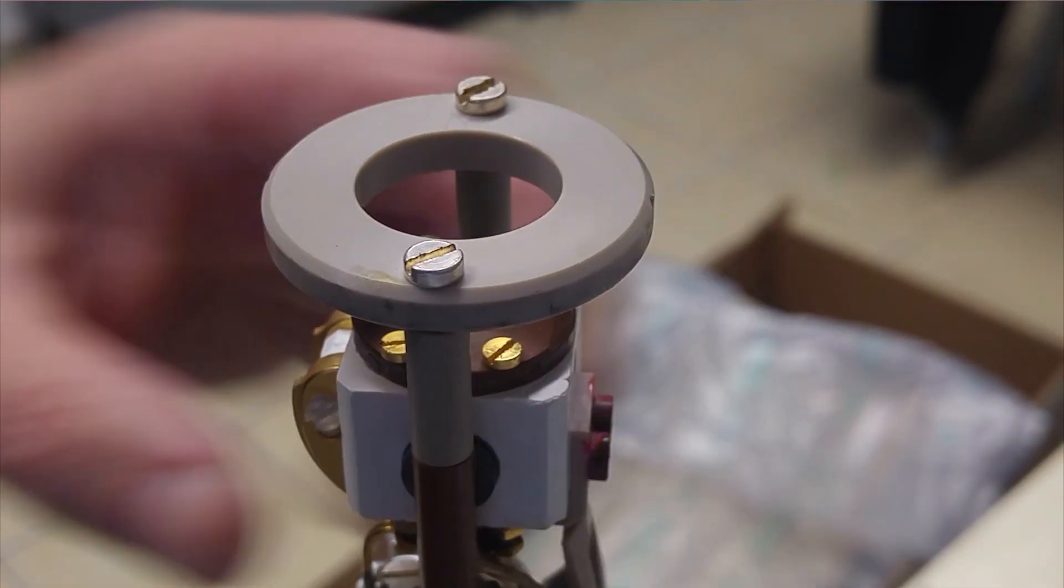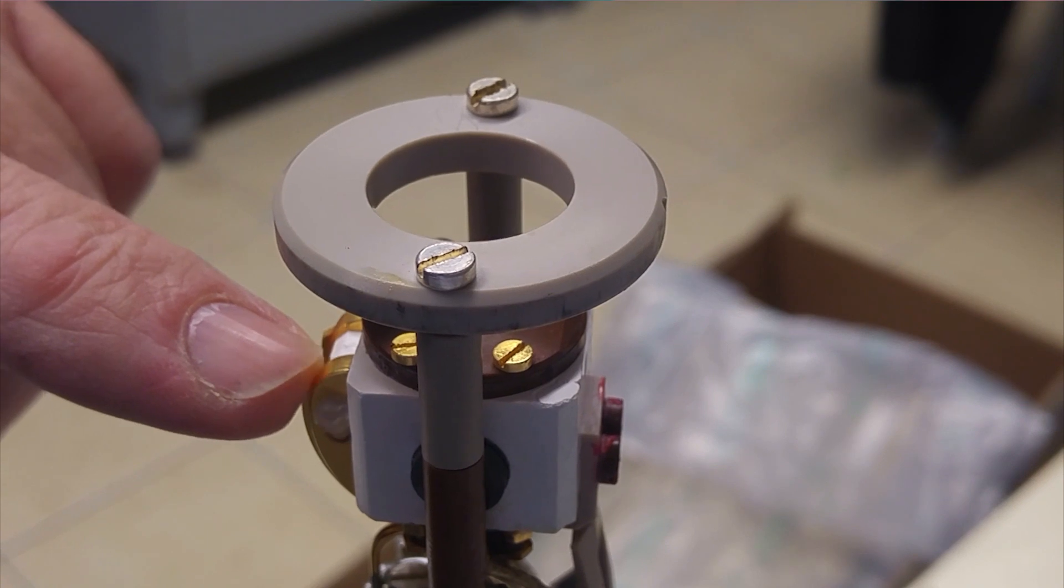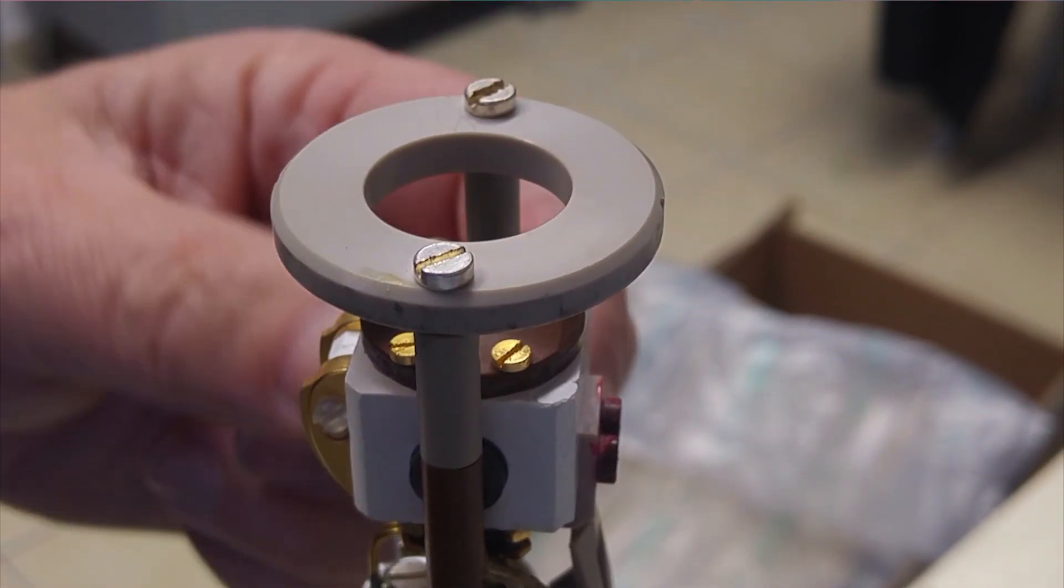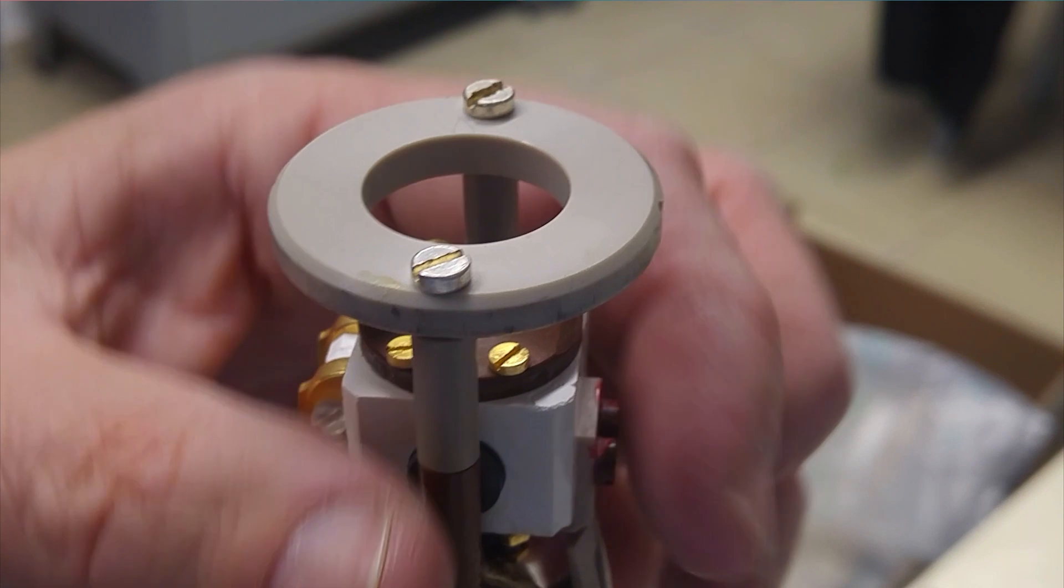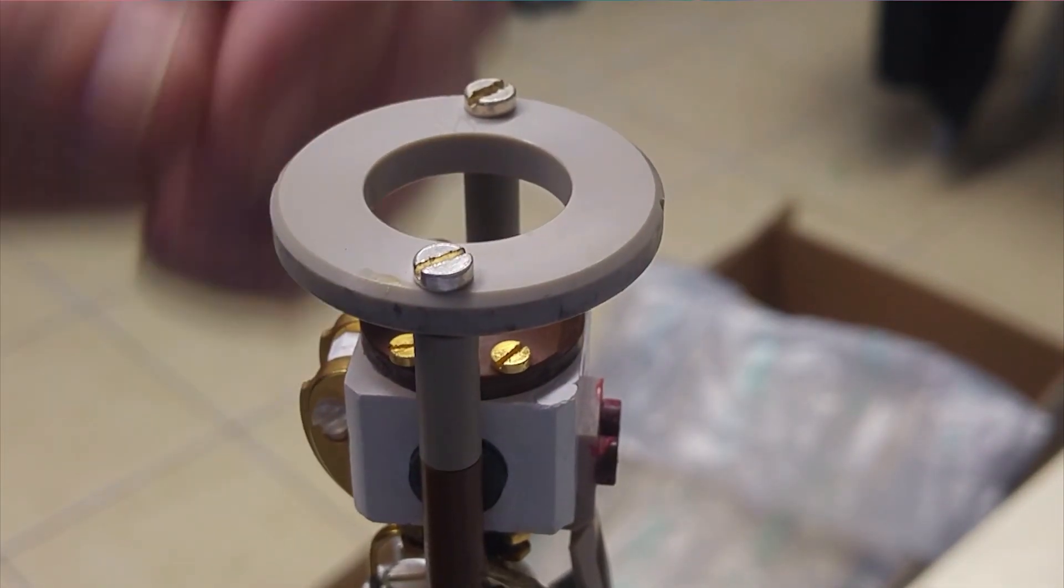So this here is the stator with the coil in it here. What we're going to do is take these two screws off, and then we can detach this section and pull this free.